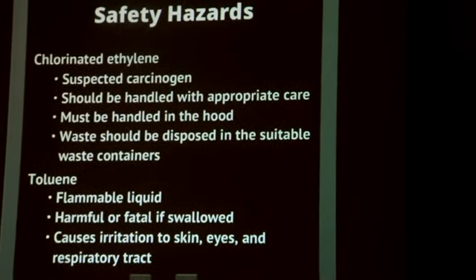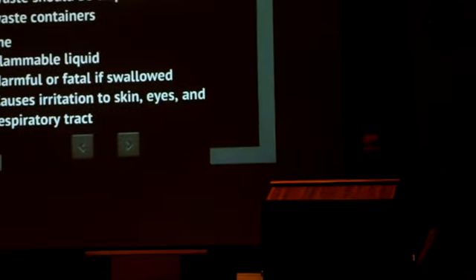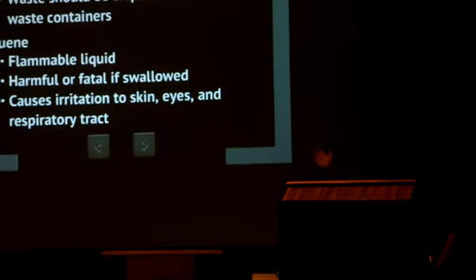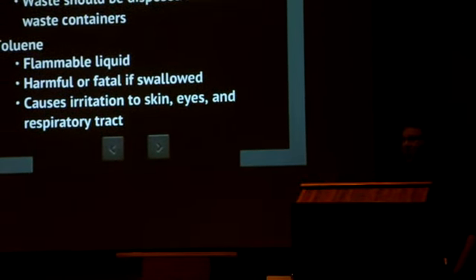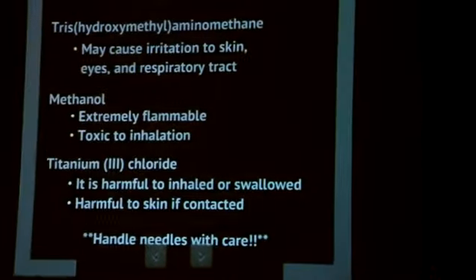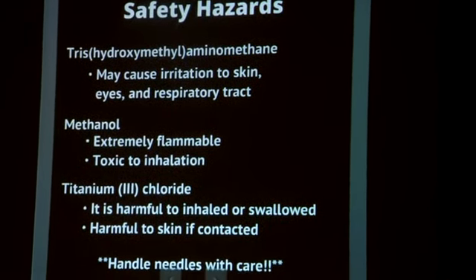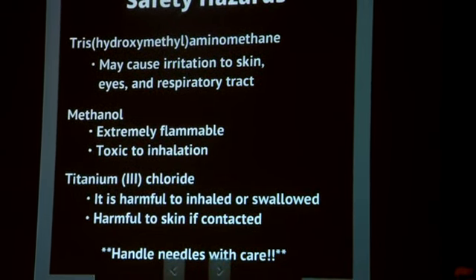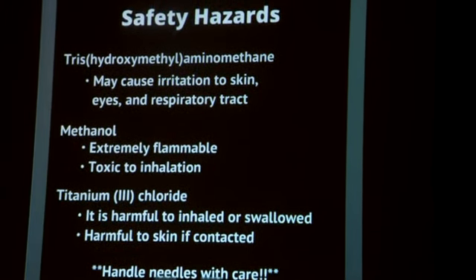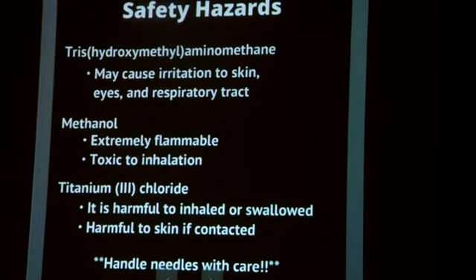All right, safety hazards. We've all been in chemistry labs, so just take natural precautions, especially with everything. Don't drink it. We really want to stress the most important thing is handle the needles with care. We don't want to get pricked, obviously, and we only have 4 of them left for this entire lab session, so we don't want to break them, which is very easy to do when you're in a rush. So just be very careful in handling those.